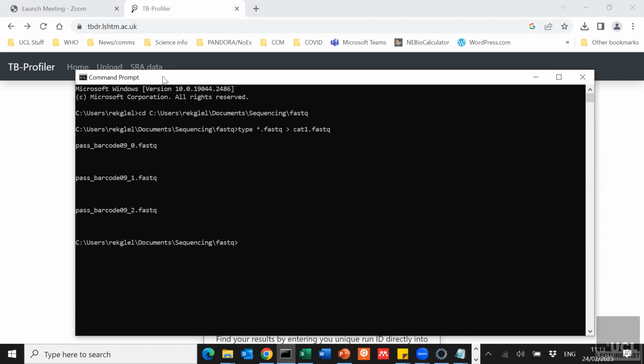We might find that if we're all trying to upload these files together, it starts to struggle, but we can still give it a go. Yeah, the files can be listed like that. Yes, okay. Space. That's fine.